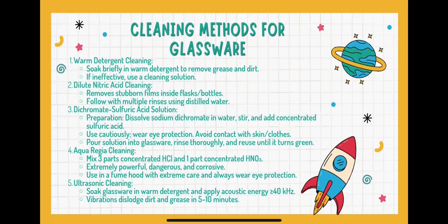Now I will teach how to clean glassware with the correct method. First of all, use warm detergent cleaning. Start with warm soapy water to remove dirt and grease. If it's not enough, try a stronger cleaning solution.